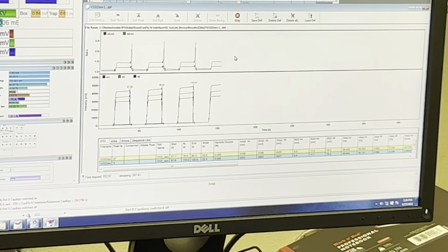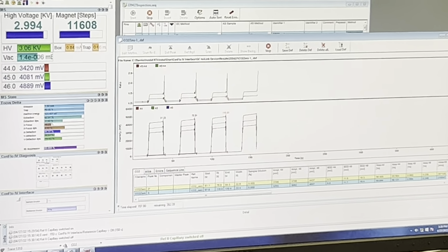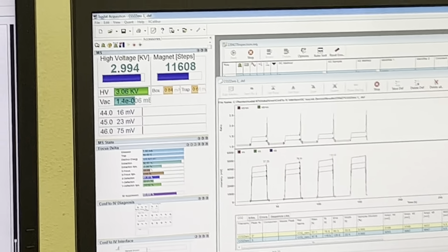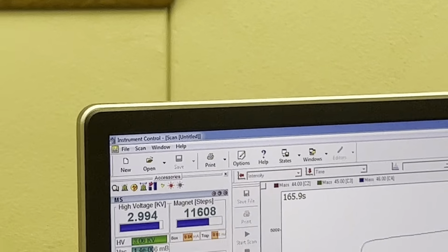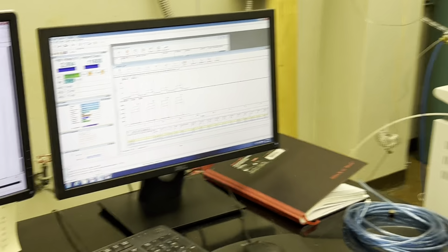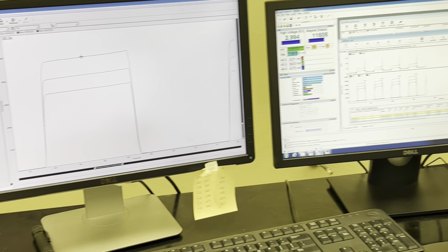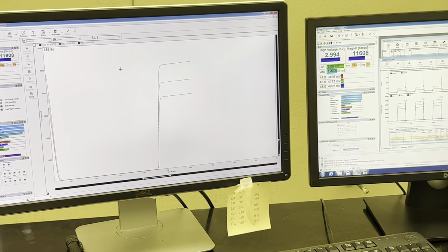And even when they're flat, ideally they're flat and they're not noisy. So when you would zoom in on them, it's a straight line. Obviously because of the scale, if you zoom in far enough, it's going to have deviation. But what you can do is look in archived on-offs and pay attention to the scale, see how wavy it was when you had really good data, and then compare them to what you have now.